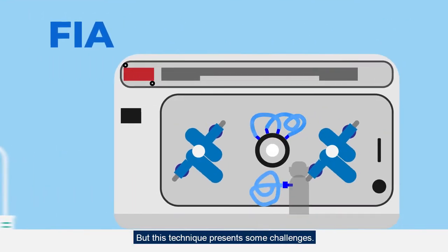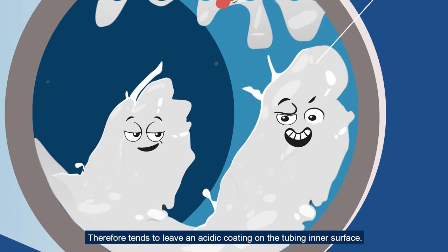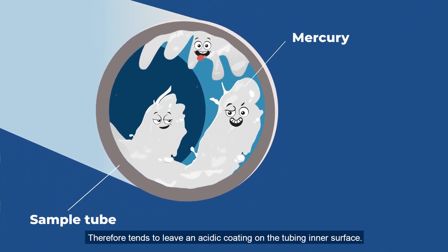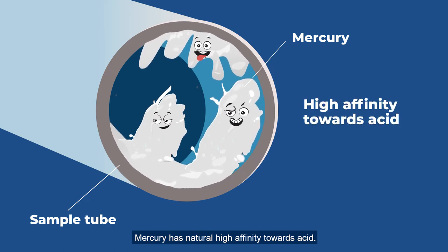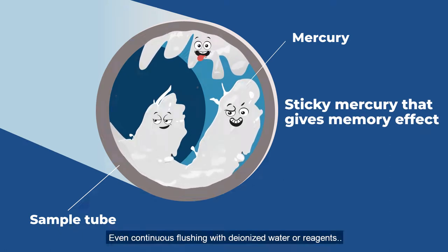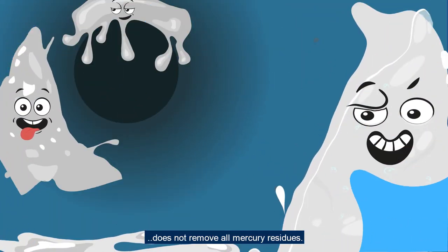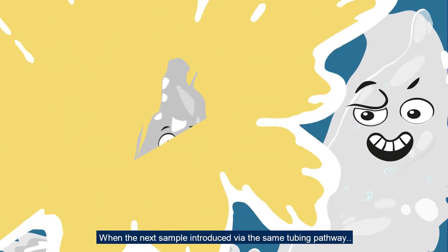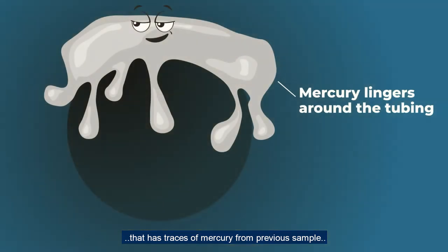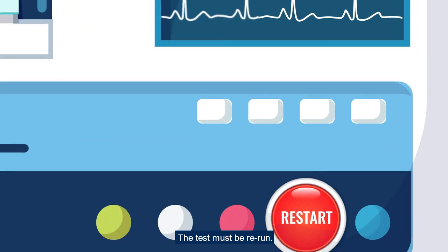But this technique presents some challenges. The pre-chemically digested sample is acidic, therefore tends to leave an acidic coating on the tubing inner surface. Mercury has a natural high affinity towards acid, thus dissolves and retains its residue as it passes along the tubing. This phenomenon is called memory effect. Even continuous flushing with deionized water or reagents does not remove all mercury residues. When the next sample is introduced via the same tubing pathway that has traces of mercury from a previous sample, it leads to a false high bias value, and the test must be rerun.